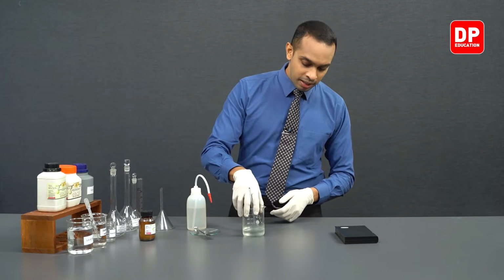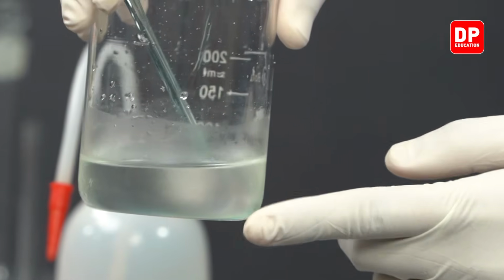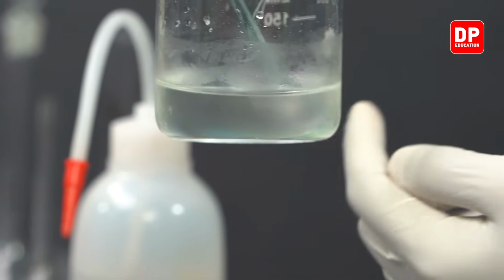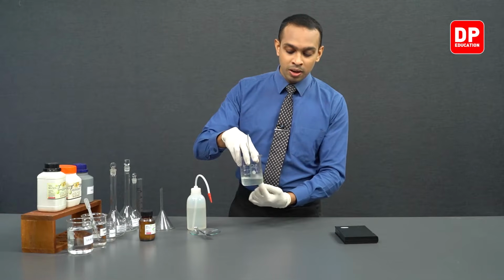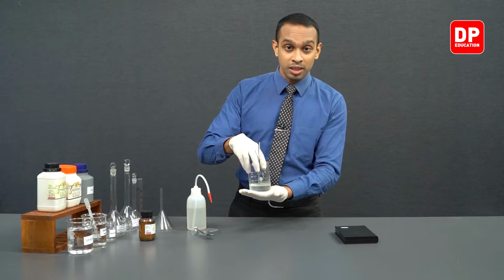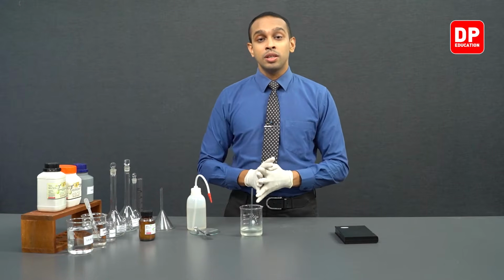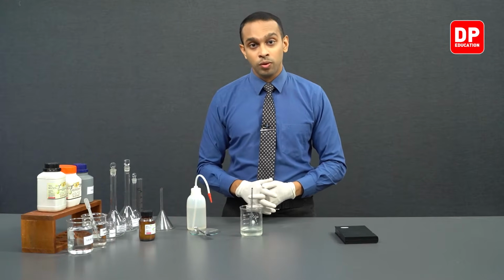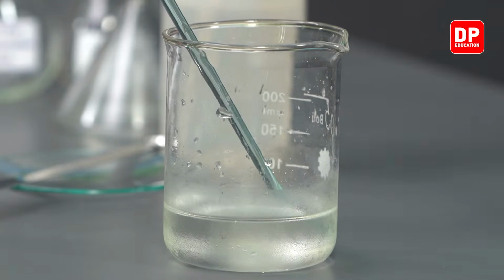You can see that the beaker is now very cold, and you can visually observe that as well, because you can see the water vapor is starting to condense around the outer walls of the beaker. So this indicates that the solution in the beaker is quite cold, and this happens because dissolving potassium iodide in water to form potassium iodide aqueous solution is an endothermic process which results in a temperature decrease when we are dissolving potassium iodide in water.